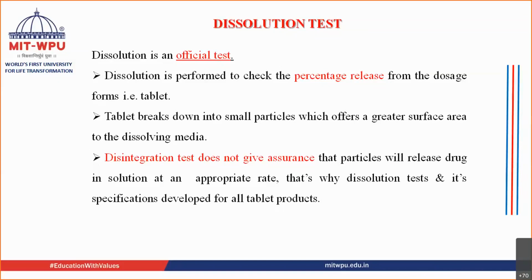Dissolution test. Dissolution test is another test which is official in IP. In the dissolution test, what you determine is the percentage release of the drug from the dosage form. How much amount of drug is getting released from that dosage form, that is what you determine.